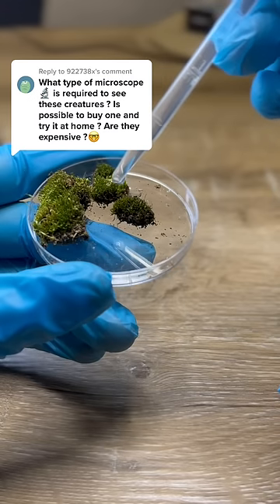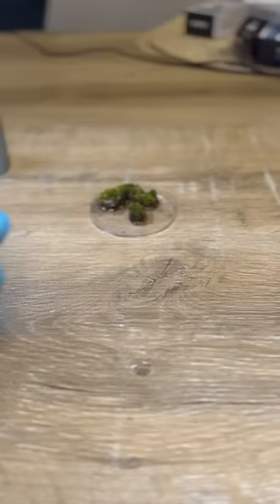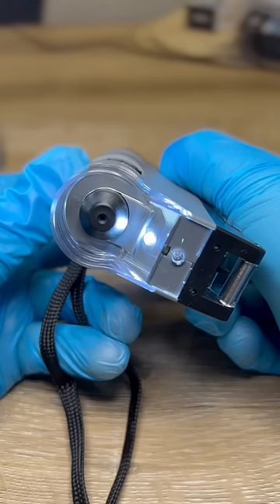Do you need an expensive microscope to see a water bear? Nope. This is a Carson Pocket Microscope, and everything about it is perfect for seeing water bears.